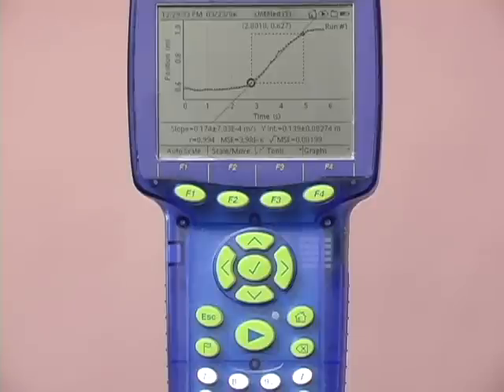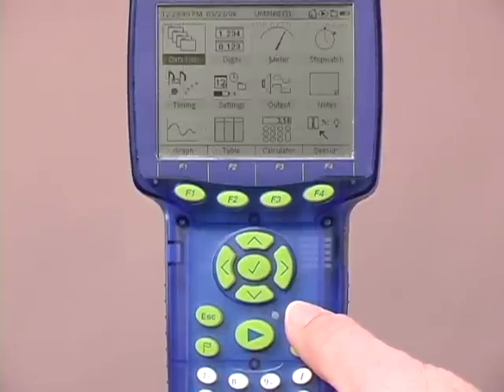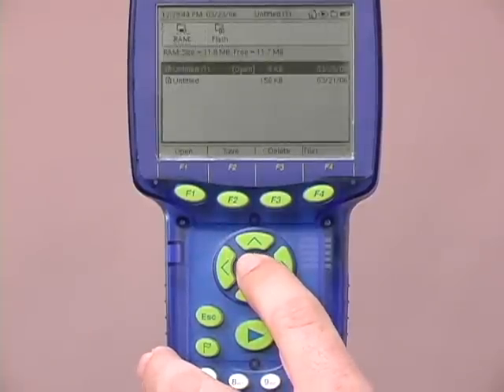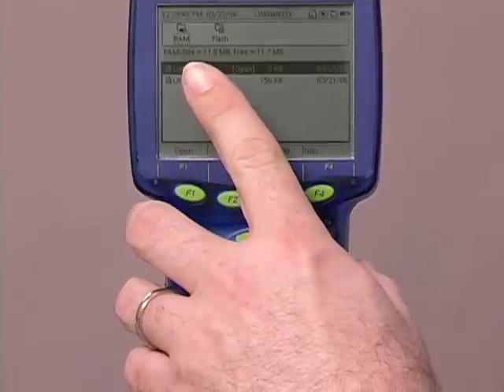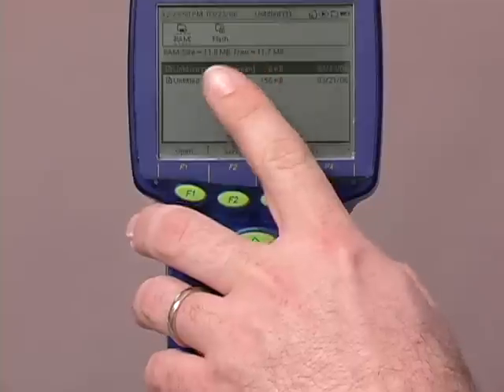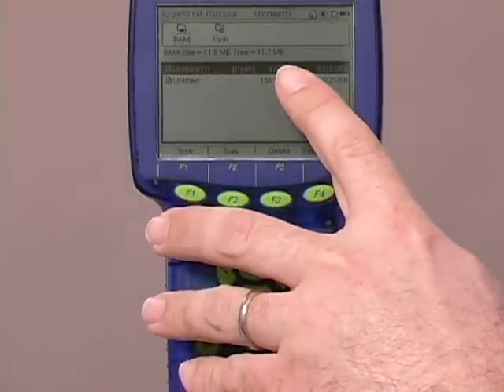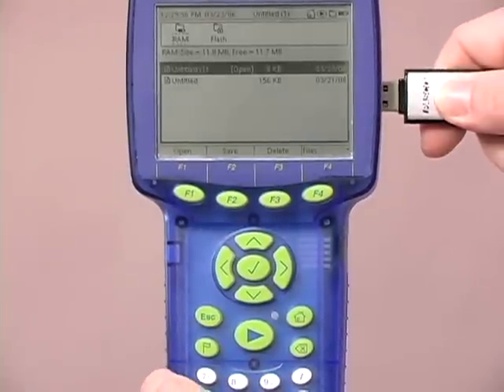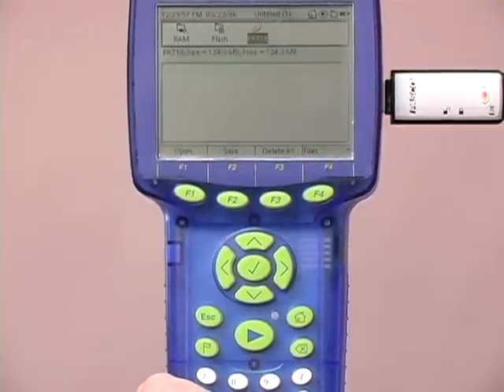Once I've finished my analysis, I'm going to want to go ahead and save my file. I'm going to move to the home screen and to my file management system. As you can see, it shows the working memory of the Explorer GLX and the flash memory where I can store things like templates. This is the file I currently have open, so I'm going to go ahead and connect a flash drive.